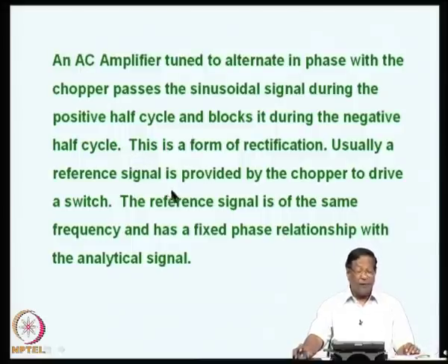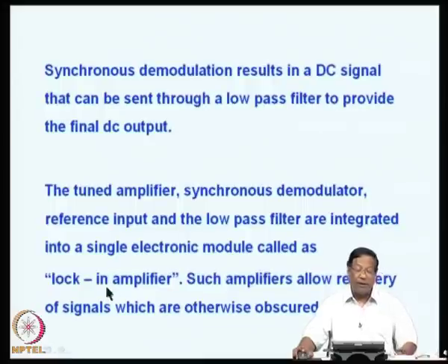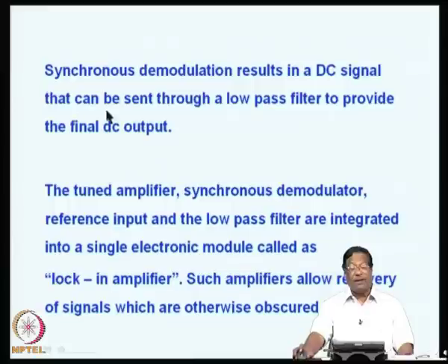This is a form of rectification basically. Usually, a reference signal is provided by the chopper to drive a switch. The reference signal should also be of the same frequency and have a fixed phase relationship with the analytical signal. This is very important, because unless it is synchronized, you will not get a decent signal at all. So what you need is a synchronous demodulation, and this results in a DC signal that can be sent through a low pass filter to provide the final DC output.